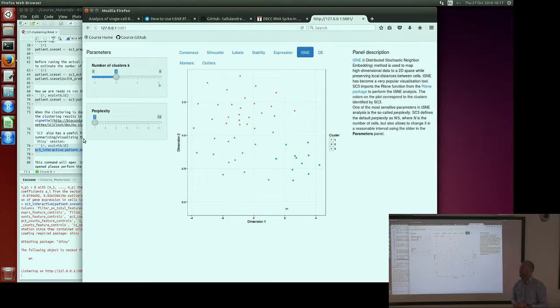Yeah. So I also remember yesterday you mentioned that you get different results if you run it multiple times. Yes. So is it recommended then? tSNE. Yeah. Well, as I said, yes, you're right. If you run it multiple times, you will get multiple results. But if your clusters are stable and strong, the results will show the same thing. The map will be a bit different, but still the clusters will be the same.